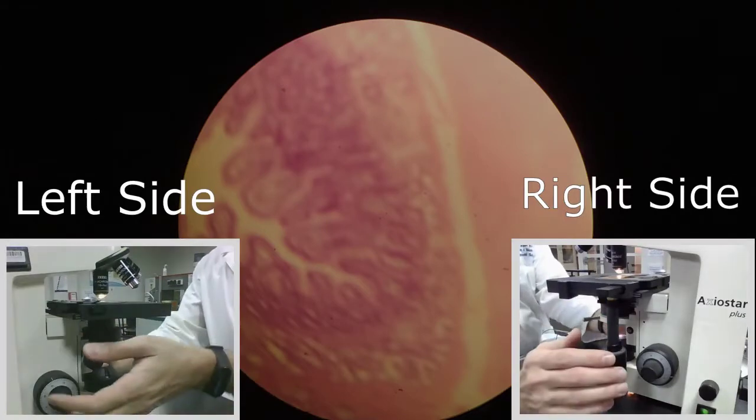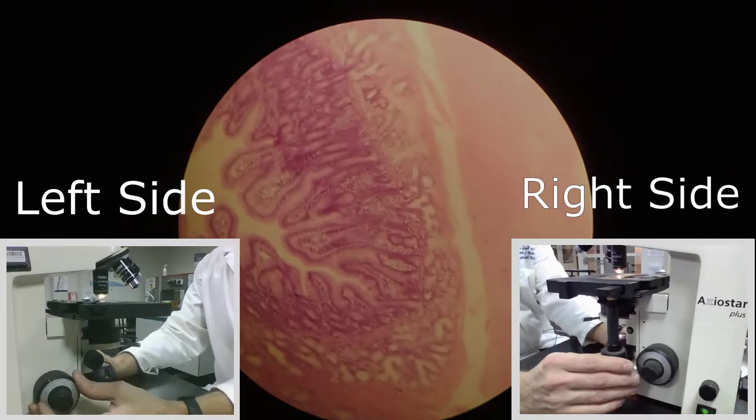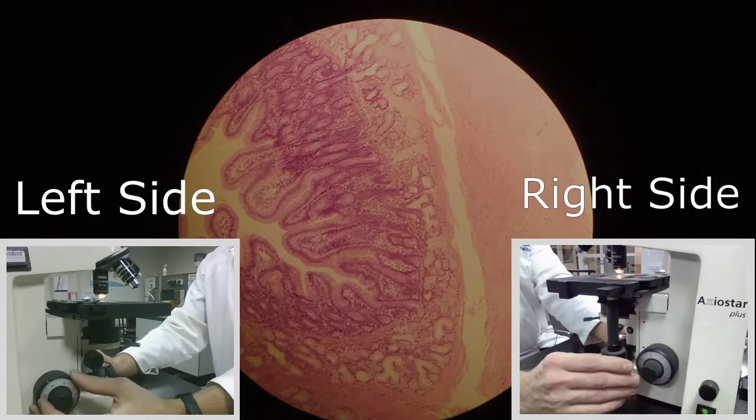In order to do Köhler illumination, you first need to get a slide into focus. I have a slide under the microscope here — the small intestine, in case you're curious. I'm just going to get it into focus.